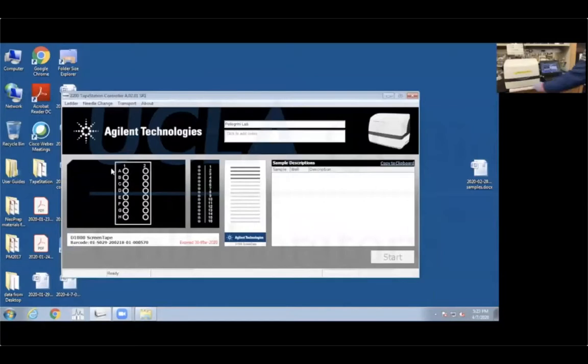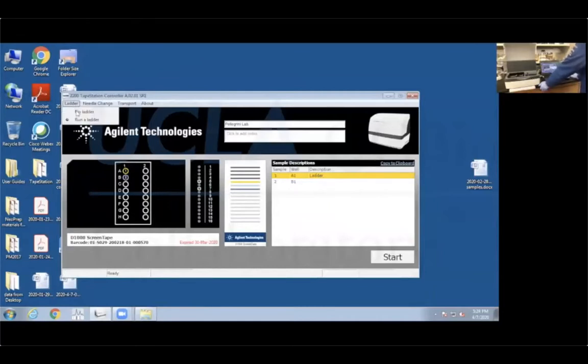Okay. So as you remember, we put our samples here, top left, so position A1, B1. And automatically the machine thinks that you are using a ladder. We are actually not using the ladder, so I'm just gonna click on no ladder, and I can put my sample names 1 and 2, and everything else is in. 16 tips in the tips holder, so we're good to go. It requires only 2 here, and then it highlights the lanes that are going to be used. So I'm just gonna press on start.